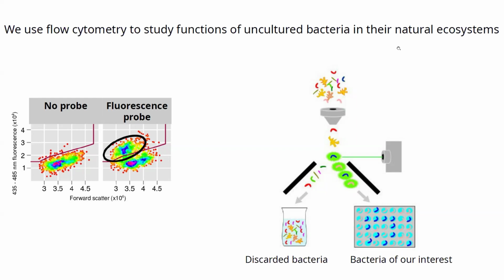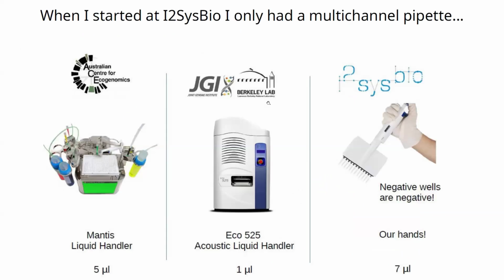During my postdocs, where I learned these techniques, I was working in quite rich laboratories that had a lot of robots helping to deal with these single cell techniques. This is very important because when you distribute liquid solutions, lysis buffers and whole genome amplification reagents, you have to be very careful, because there can be contamination from the air, from your own DNA and so on. What you think is a single cell can actually be a highly contaminated well, and this is very dangerous.